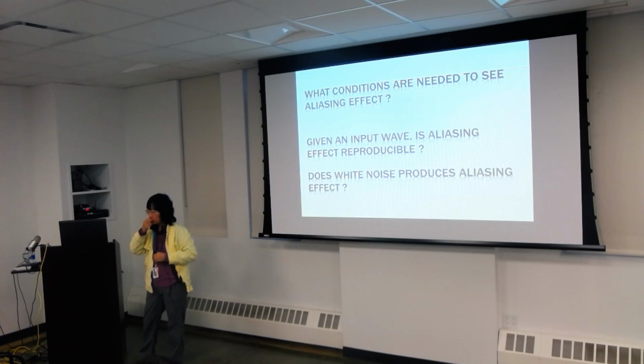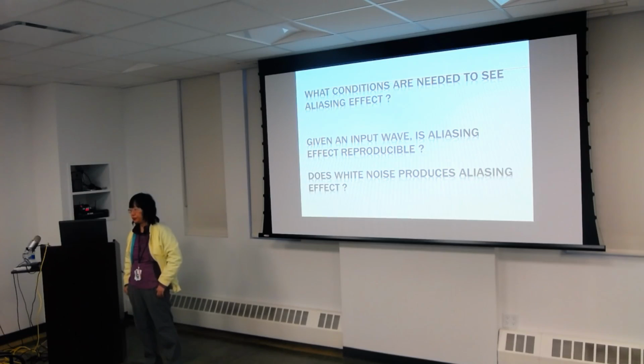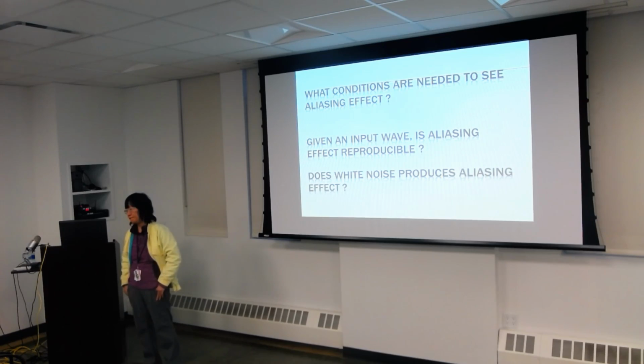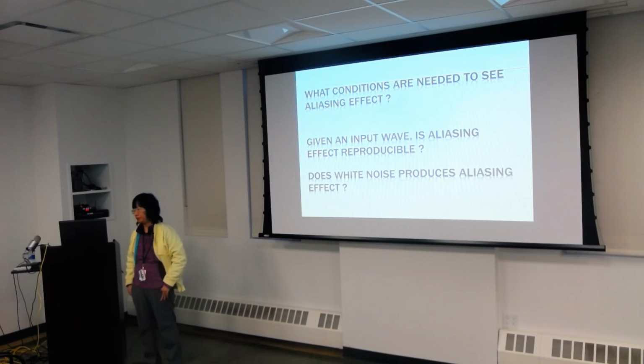Now let's think about pure noise. Wouldn't it be routinely subtracted from your contrast calculation, because you're picking your particle and you're picking a background spot? If the white noise is constant through infinity, it would be part of the background that you're already subtracting, so it shouldn't come into the calculation to begin with. That's probably true, that's a good point. As long as the noise doesn't essentially preclude you from picking particles. If the noise is so high that you're unable to pick particles, then you can't really do anything about that. But otherwise, it should be subtracted.